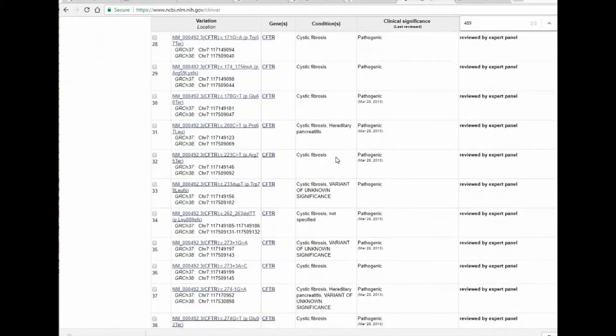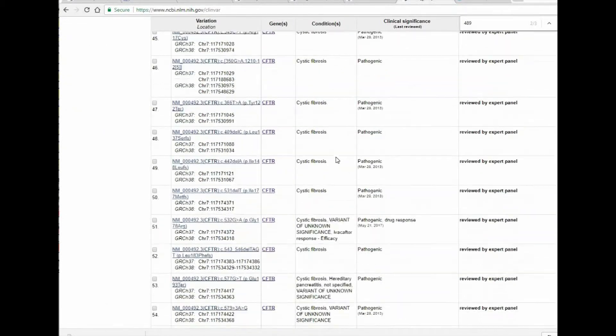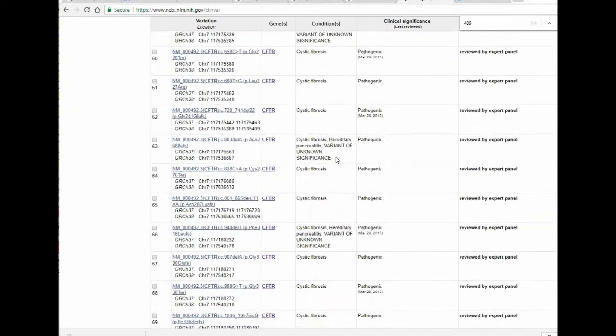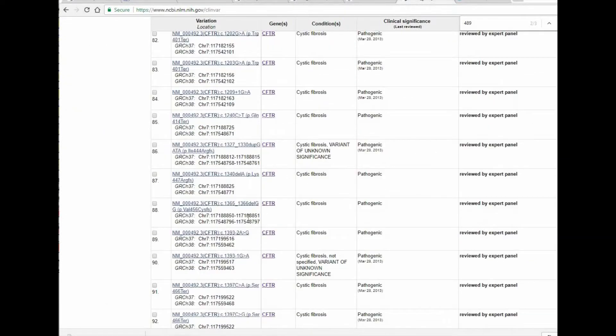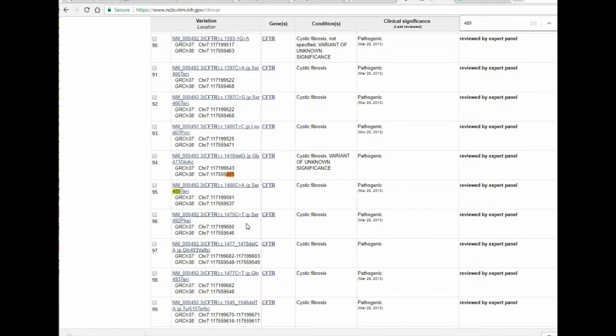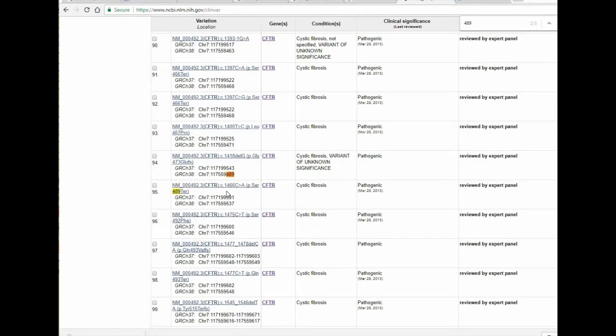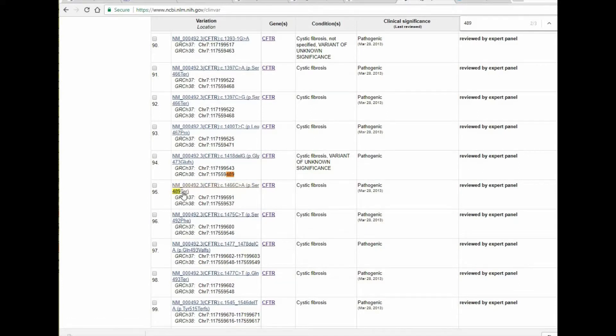We'll broaden our search to expert panels. And for simplicity, I just know that a good site happens to be the substitution that results in the change of the serine at 489 to a termination codon.